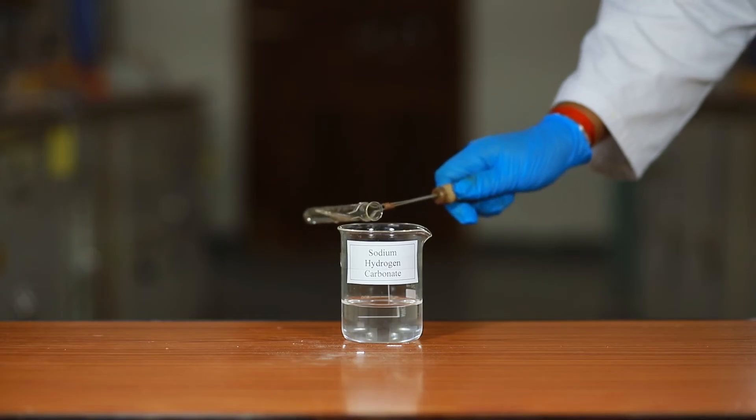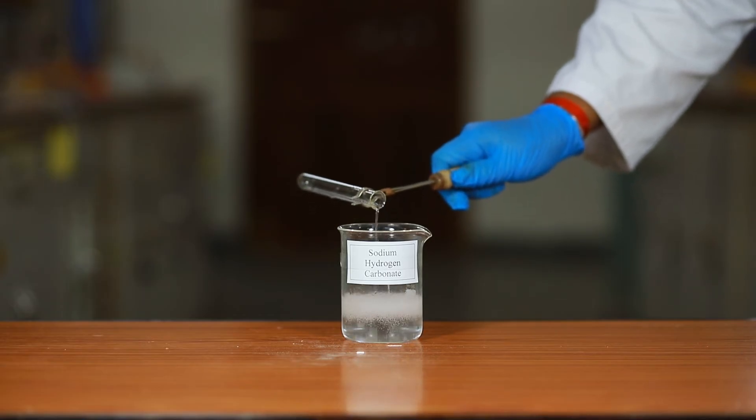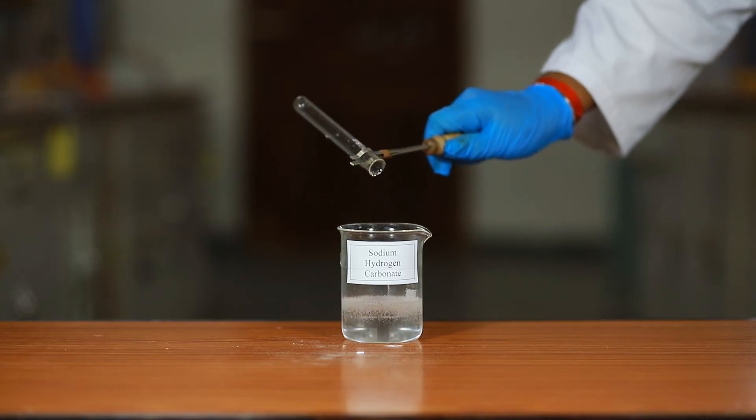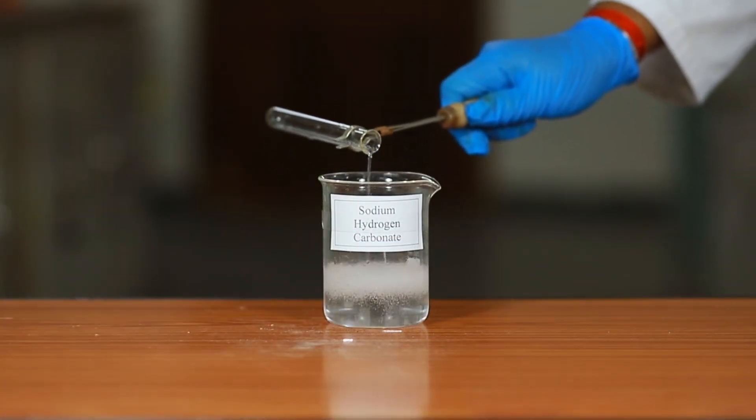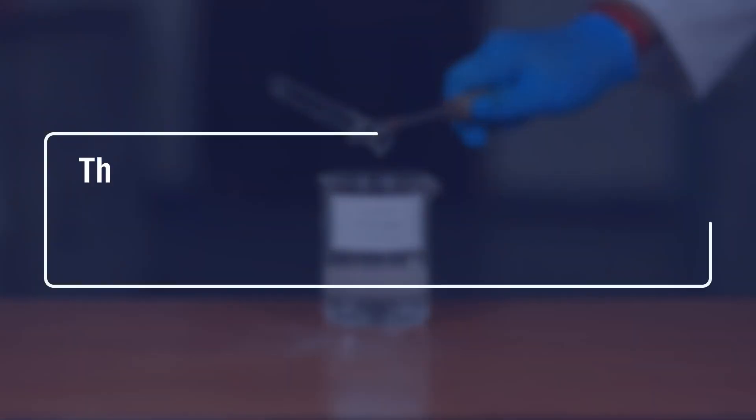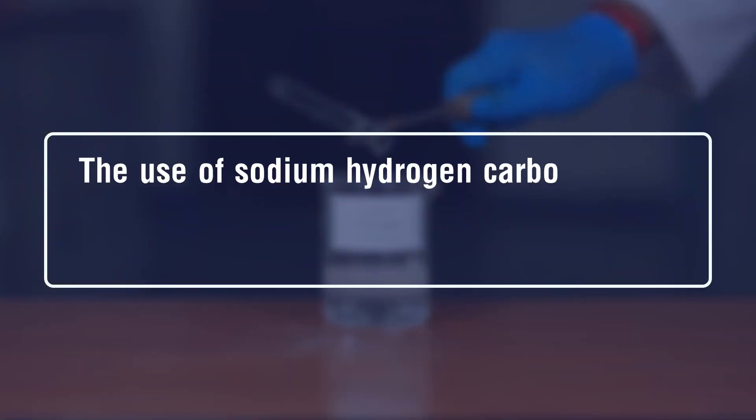Pour the reaction mixture into a new beaker containing aqueous sodium hydrogen carbonate solution. Effervescence with bubble formation is observed. The sodium hydrogen carbonate removes unreacted ethanoic acid from the mixture.